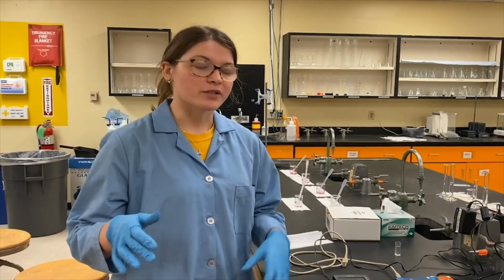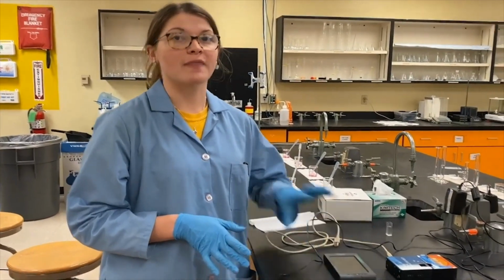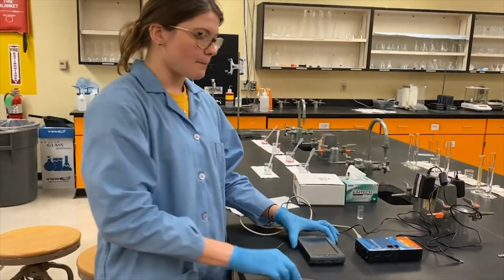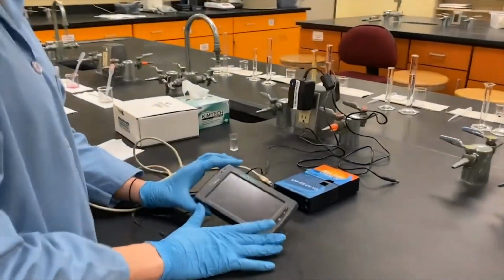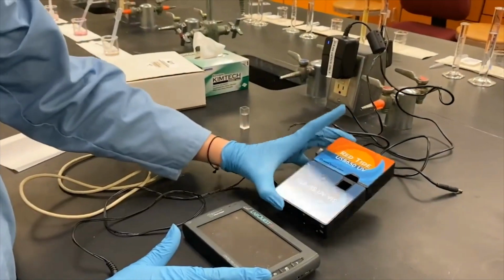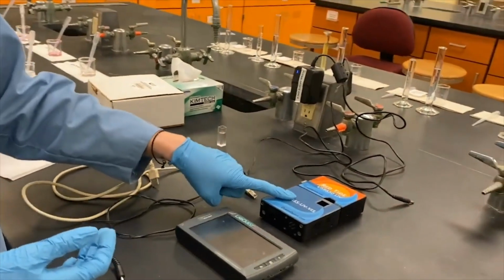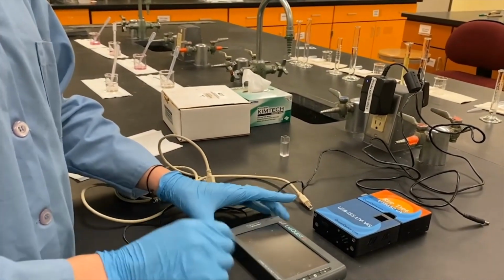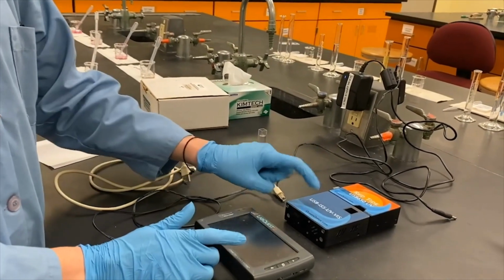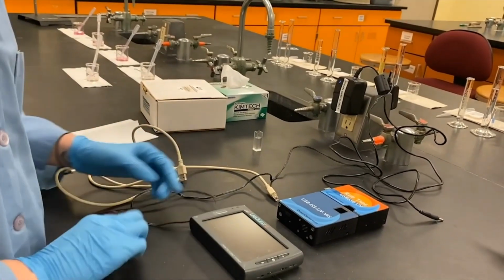So the first thing we have to do as far as getting our experiment started is let the electronics warm up, and then we'll go off and make our solutions. But first, we're going to plug everything in. So here we have a LabQuest 2 and a Red Tide USB 650 UV Ocean Optics. And essentially this is what's reading our absorbance. And this is kind of just like the computer screen that shows us and will tell us our readings. Otherwise, if we just had this, we wouldn't be able to get our measurements from the screen.